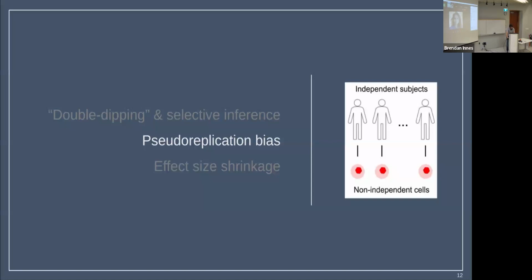Do you know how fast this method is? I assume that's TN test, and no, unfortunately, I haven't tested it. I can guarantee you it is orders of magnitude slower than doing the fastest implementations of the Wilcoxon rank sum test. For example, that Presto implementation of the Wilcoxon rank sum is insanely quick. So this is going to be significantly slower, which is why I would argue that, unless it matters to you, maybe don't worry about it, but now you know, so that if it matters, you can take the time and actually do it.